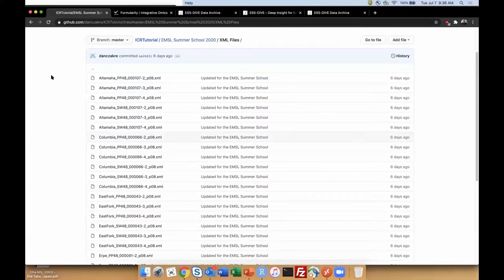I do want to add another note that there are currently other ways in development to do this step. They're just not currently ready. And I don't want to tip a hat or anything, but there are ruminations of trying to implement this type of step in things like KBase to make it more usable. Again, there's no official movement on that, but we're trying to make this step as broadly accessible as possible. So cool.